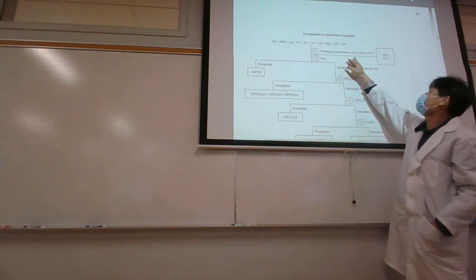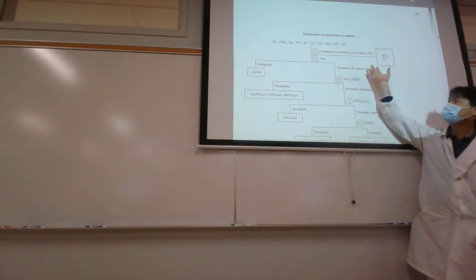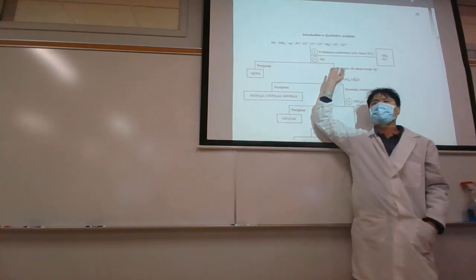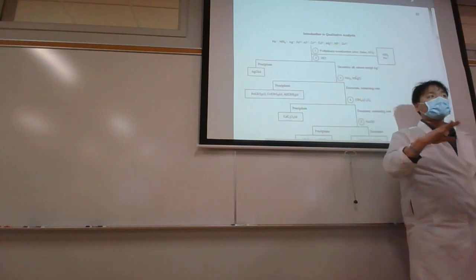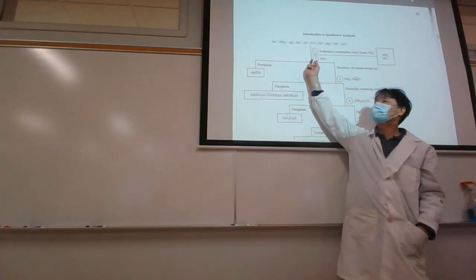This preliminary examination, color, flame, and ammonium, the ammonium test and the sodium test are independent of this flow chart. So we're going to do the ammonium test and the sodium test when there's a break in the procedure and we have time. Instead, we're going to go straight to number 2 here.